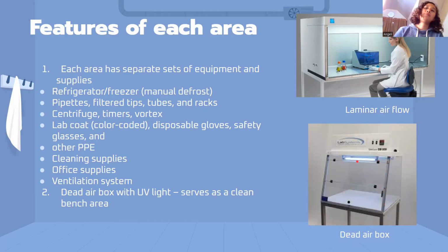I was searching, ma'am, what questions there are on the internet. Which one is better? Laminar airflow or dead air box? Depending on the need of the laboratory and the budget. However, they are good in ensuring that our products are not contaminated. So, you could use this in your reagent mix, while if you need an area where you could write, that's different.